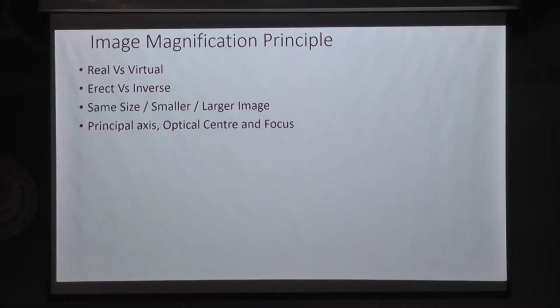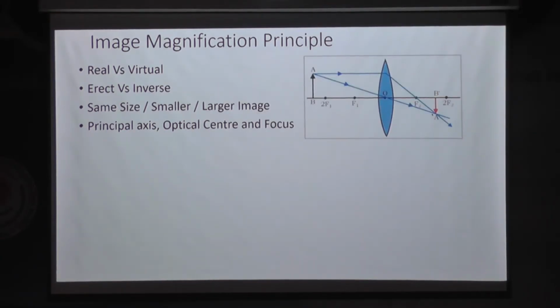Image magnification principle. Whether the image we are seeing is real, is it virtual, is it erect, is it inverse? That is something we will be discussing here. So this is the normal principle, considering the principal axis, the optical center and focus.